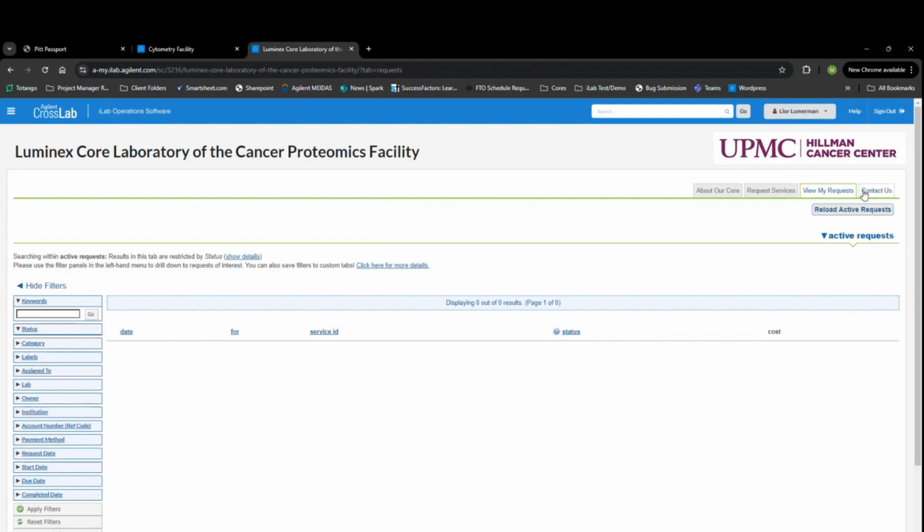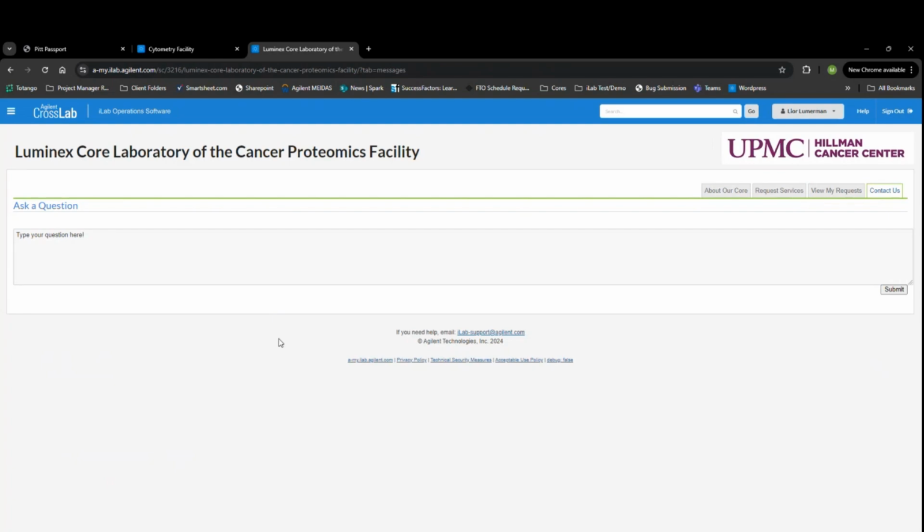The last tab we will talk about is Contact Us. So if you have any questions or concerns for the core, you have the ability to type in that question or concern here, and click Submit, and then that would be directed to the core contact that will review those questions or concerns.